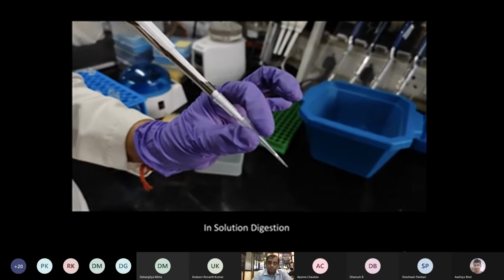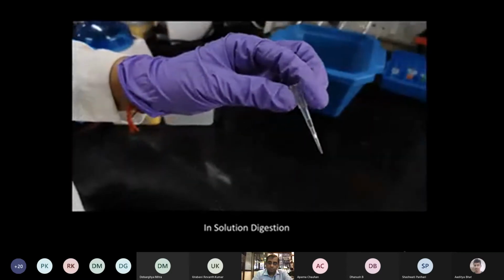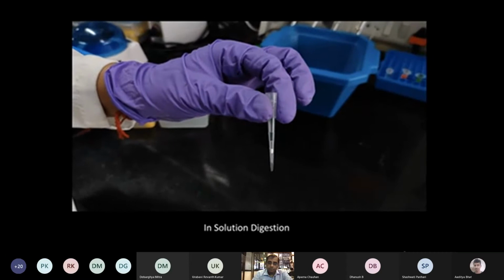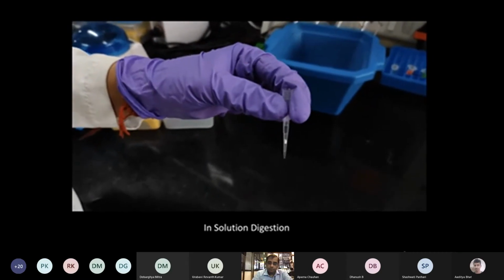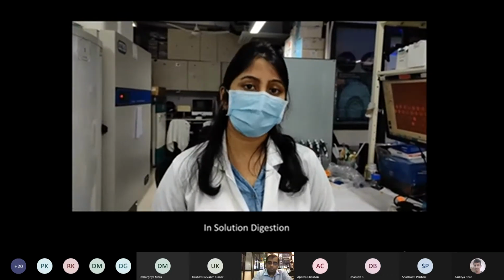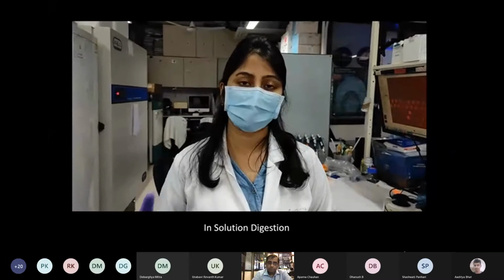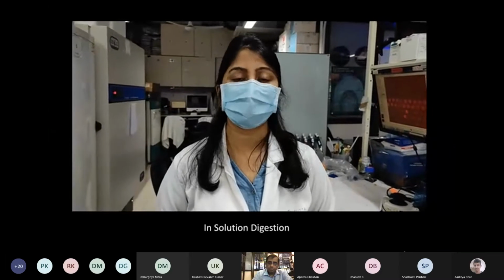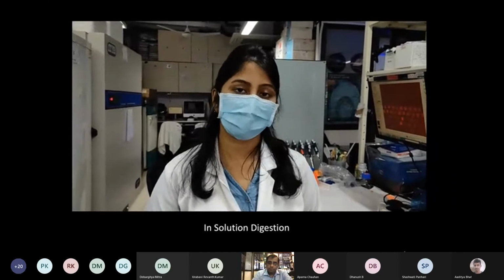This column works on the principle of reverse phase chromatography. During several steps of passing the sample through the column, the peptides would be bound to the column, and then finally the peptides would be eluted. After the peptides are bound to the C18 column, they can be further eluted using different gradients of acetonitrile. And then the eluate is again vacuum dried, and the sample can be taken for mass spectrometry.